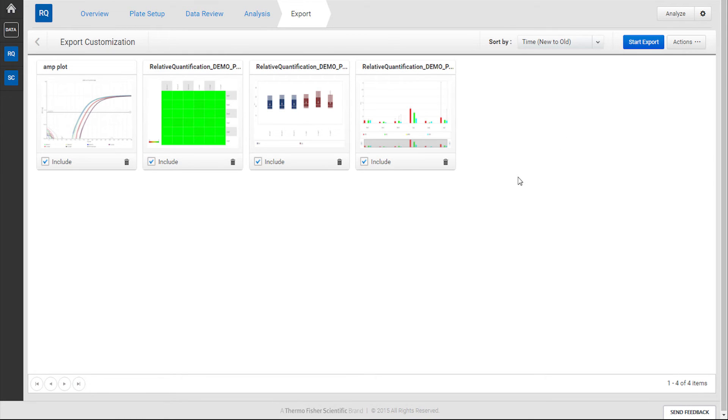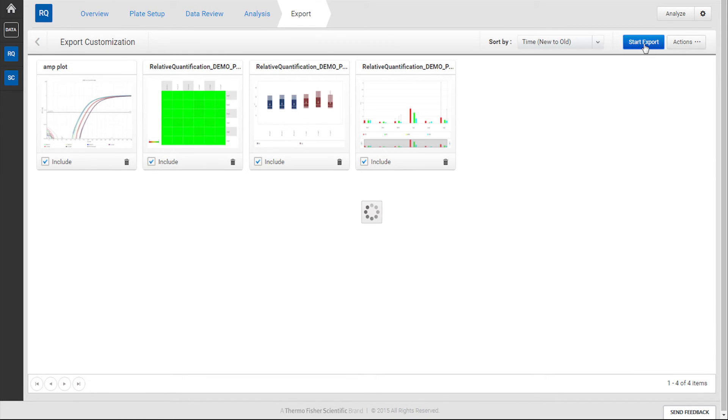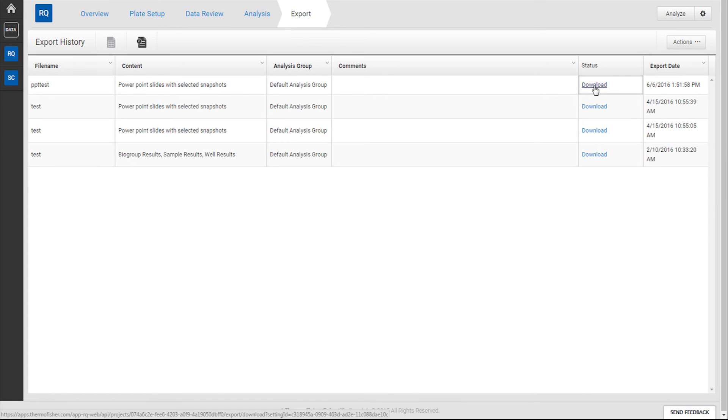When you are ready to export, click on the Start Export button and download the file when it completes processing.